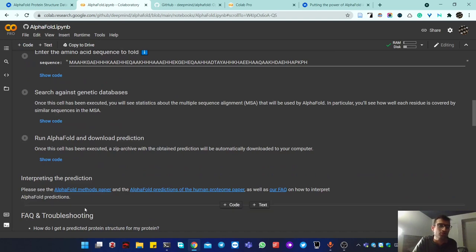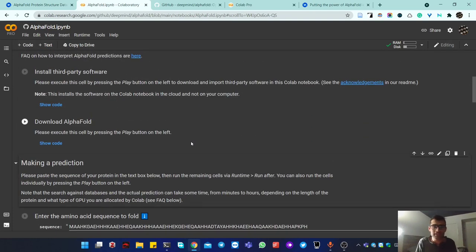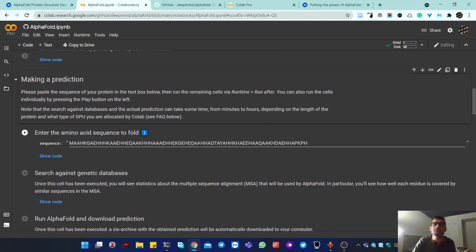The output is downloaded to your computer — similar to what's shown in the database — while everything else stays on Google's servers. The problem is that it doesn't work for every protein: as the sequence gets longer, it needs more RAM and GPU resources, and the free instance may not be enough — either due to resource limits or because many users are sharing it.